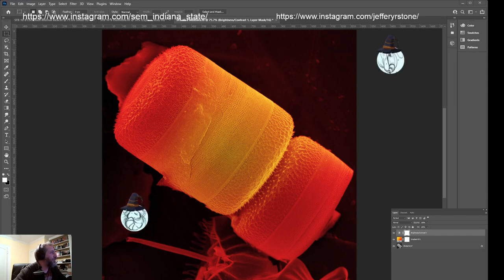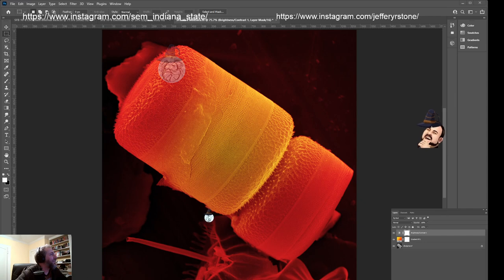Do any of the diatoms fluoresce under UV or other bands? I doubt it, but I mean, no more than any other thing with pigments. But I don't usually look at the pigmented cells, so maybe Studio would have a better answer to that question. Step one is get rid of all the living stuff so I can look at the skeleton. Let's see. It does look a little bit like a marshmallow. It looks like a piping hot piece of barbecue coal right at the points where you can throw your steaks on it to cook. Wow, Medea, you are really hungry. I think maybe you need your dinner.